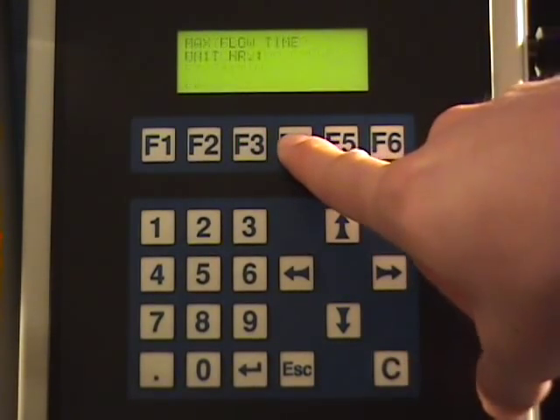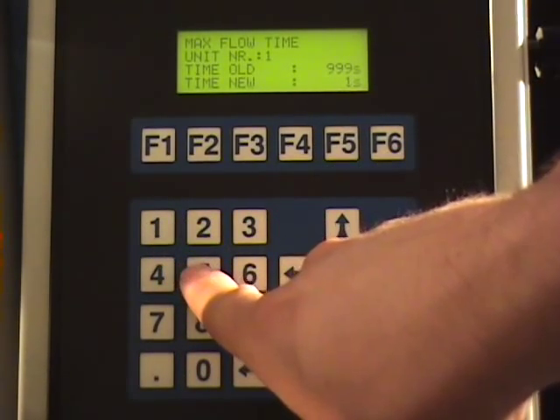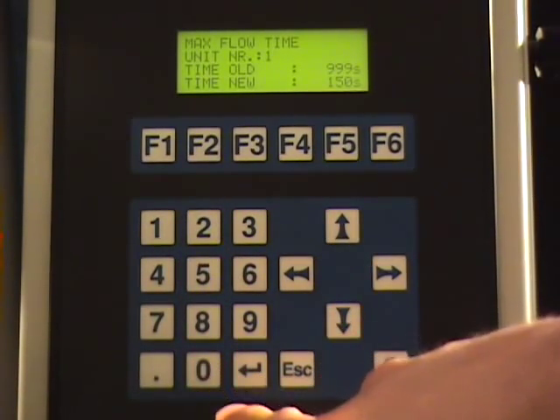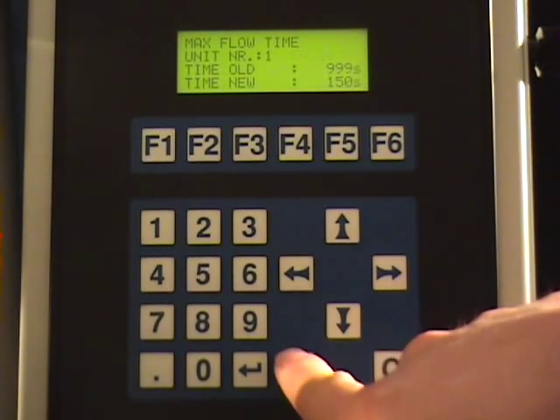Pressing F4 from the parameter menu allows you to set a maximum time for each measurement. Press enter to set this time or escape to leave the setting unchanged.